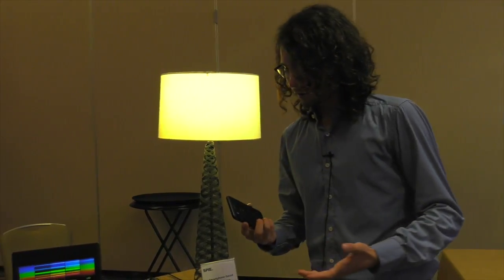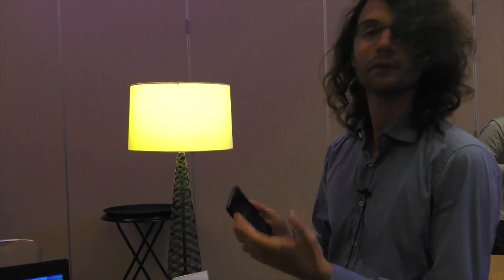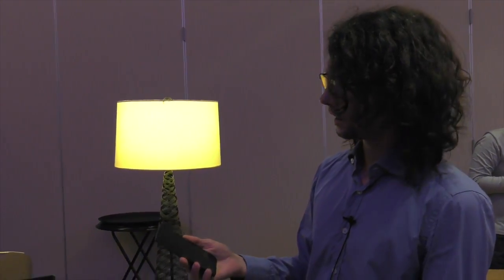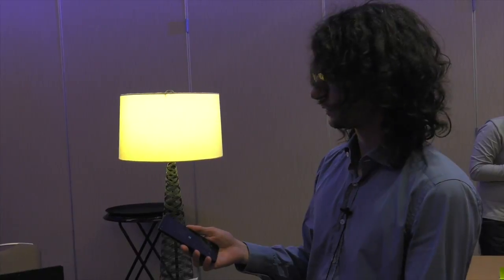So nowadays we have a smartphone which has a really good camera and the optics of this camera I can actually use in a different way, not only for pictures.